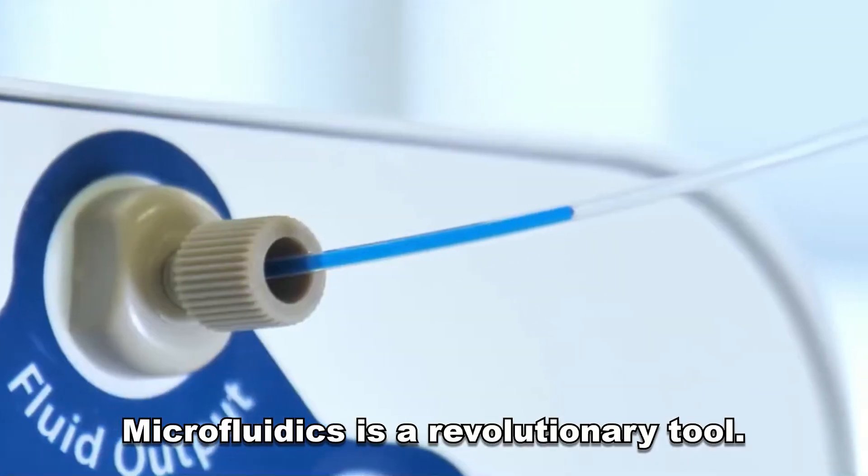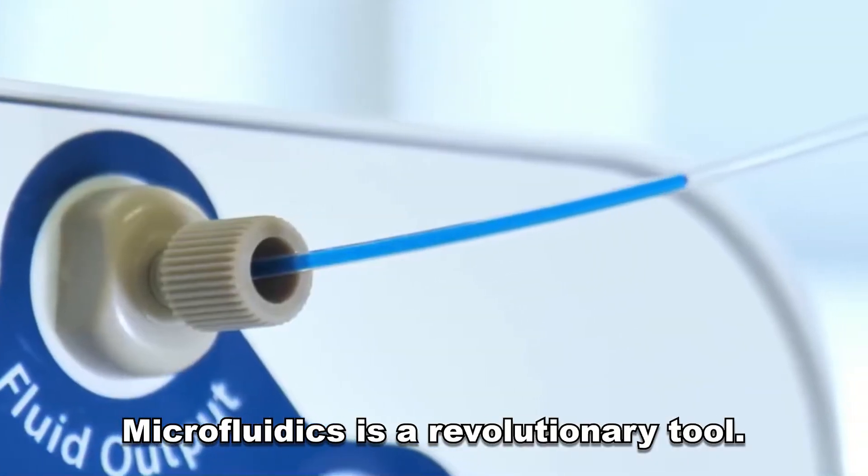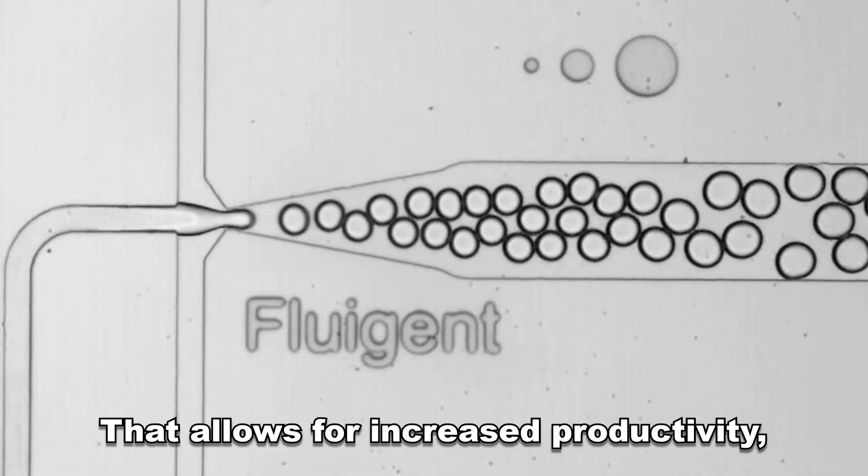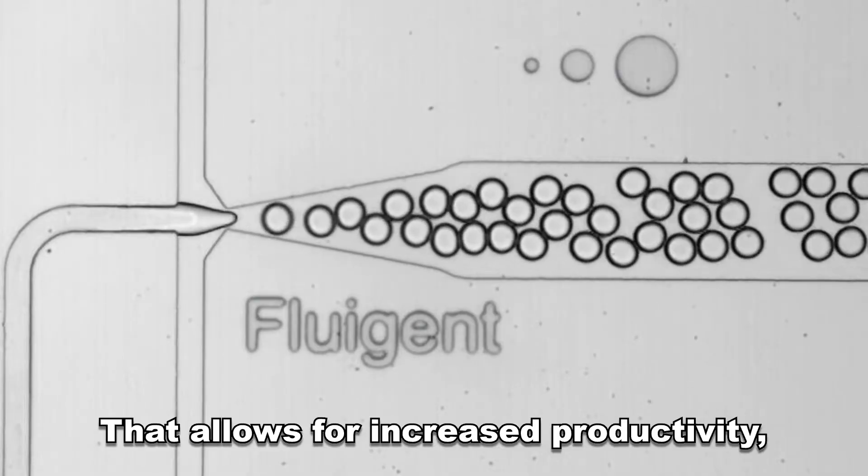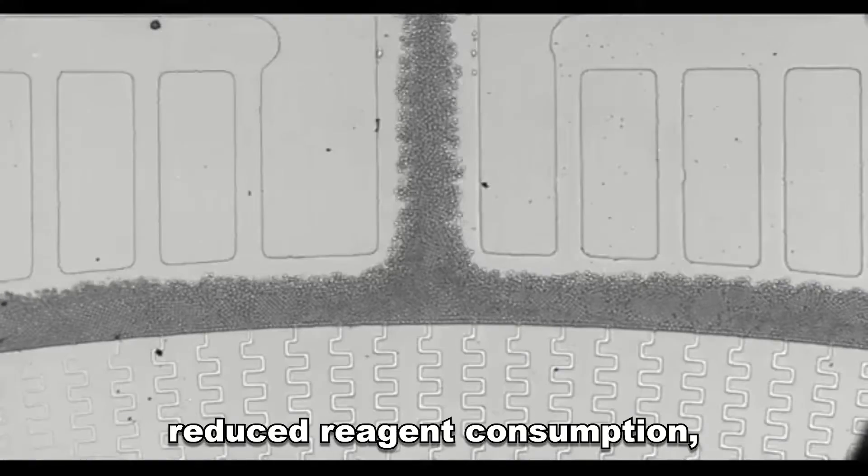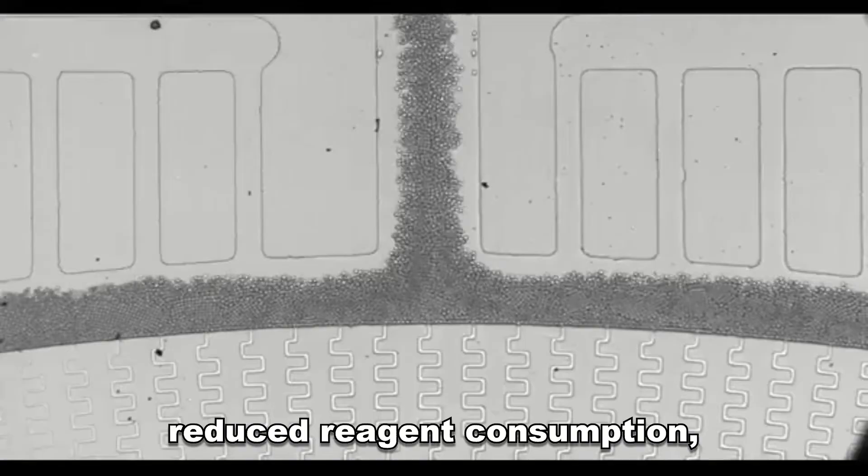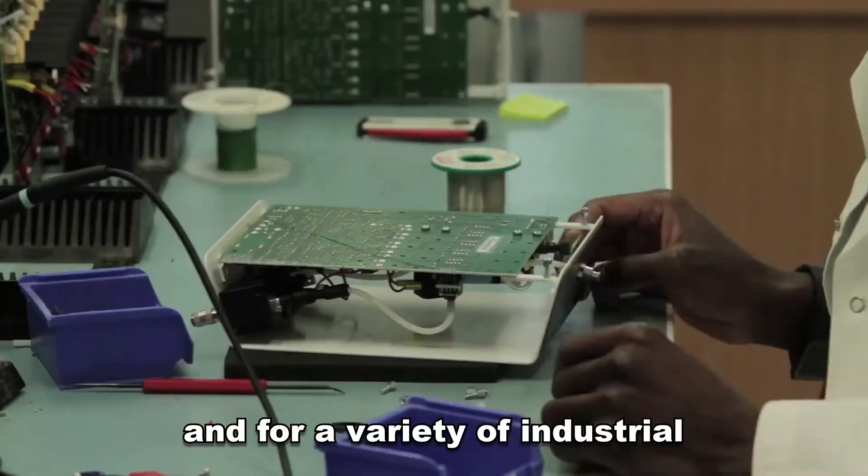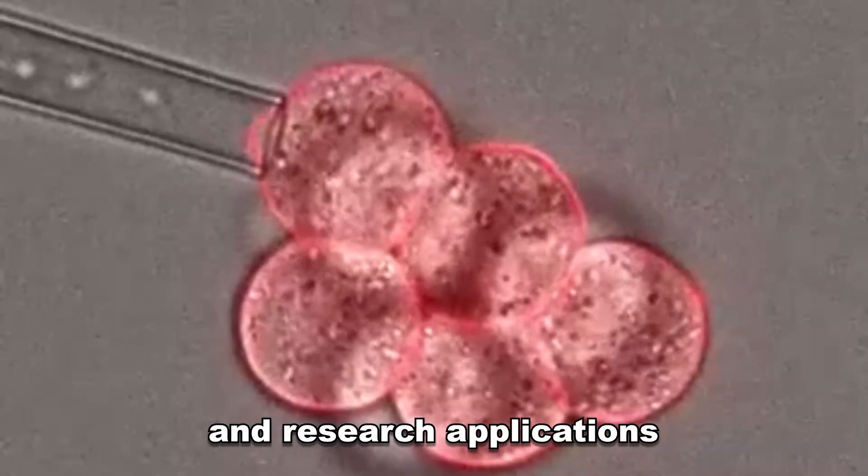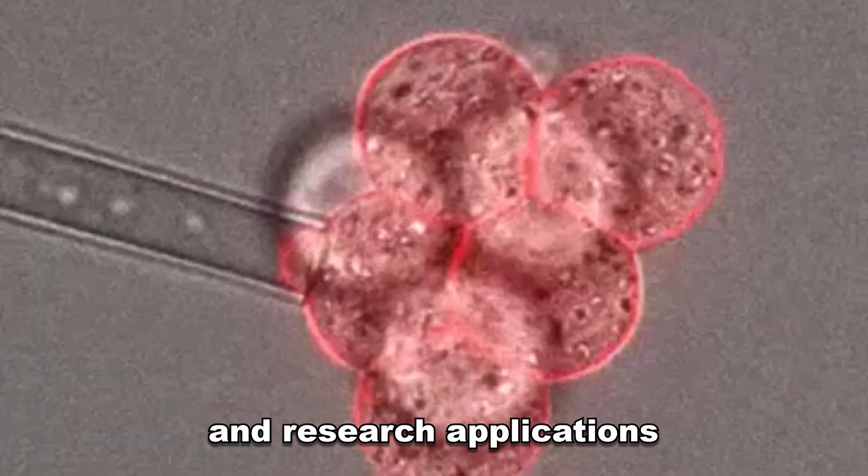Microfluidics is a revolutionary tool that allows for increased productivity, reduced reagent consumption, and for a variety of industrial and research applications.